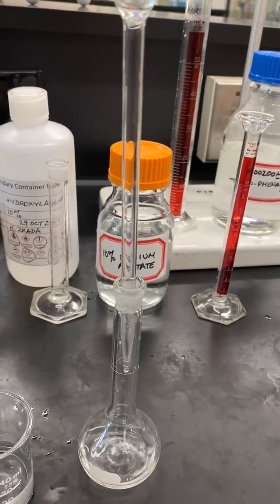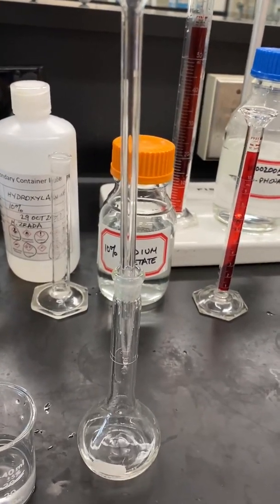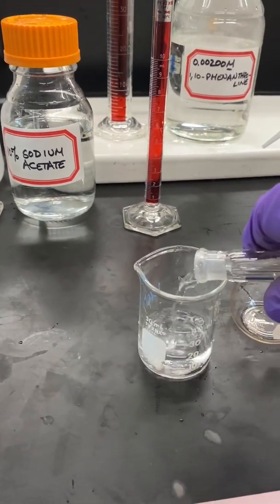Fill the 50-milliliter volumetric flask to the mark with distilled water and mix. This will be Stock number 4. Transfer all of Stock 4 into a clean, dry beaker.